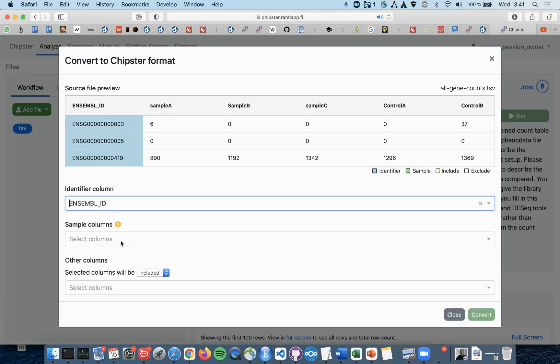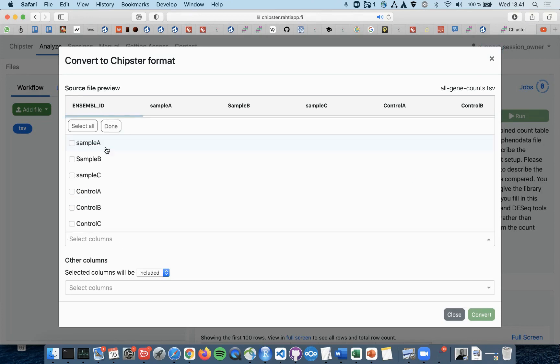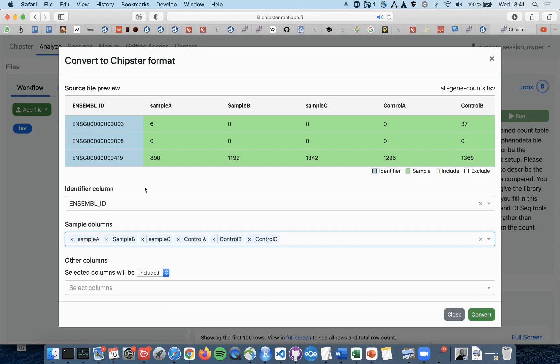Next you select the Sample columns. In this case, those would be all the rest of the columns, so life is easy and you can just select All.